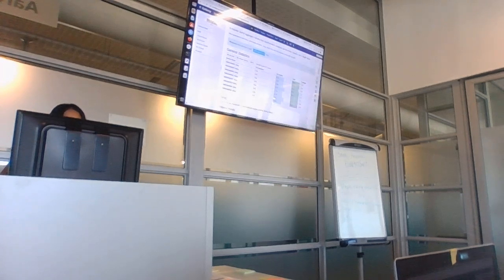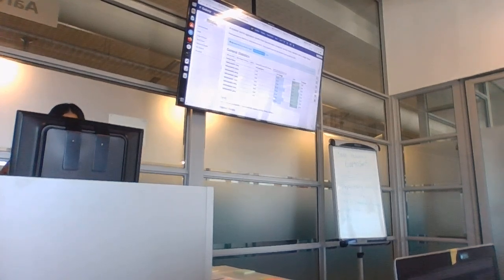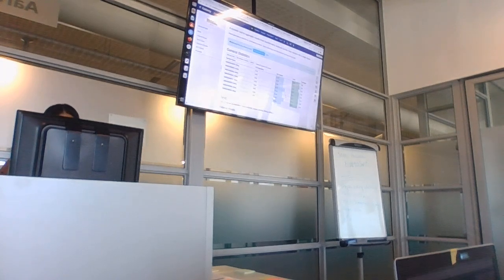So firstly, you can see that it is listing your 8 paired reads together, right? It's doing a quality report for this together. You can see that it's giving you duplication, GC content, adapter content. What do you notice under general statistics?